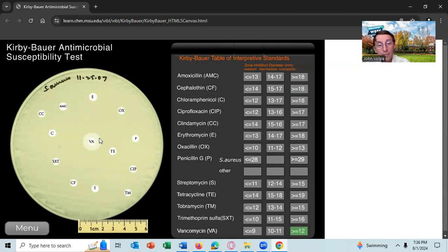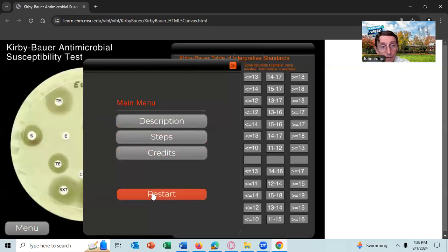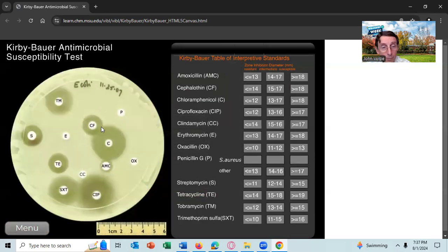Any question about any of that? Anyways, there's 3 plates. To go back to the very start one of the E. coli, you can just do it 3 times. Any question about that? All right. Yeah, I can close this.